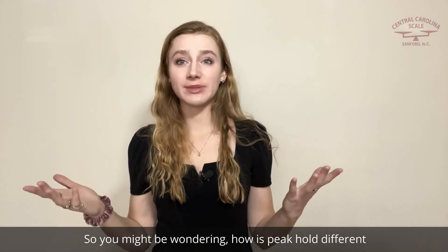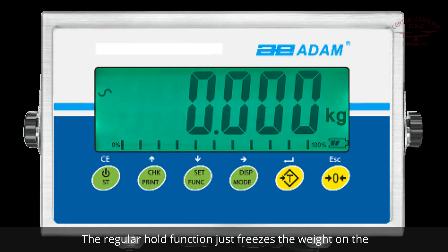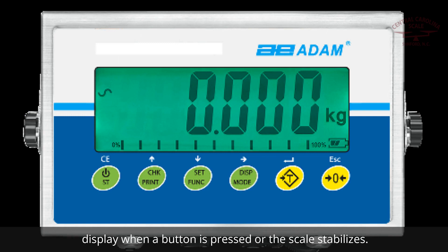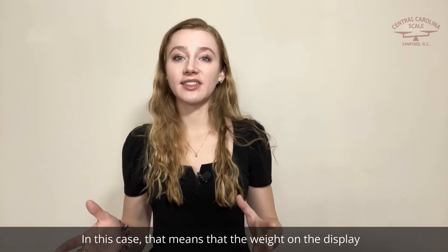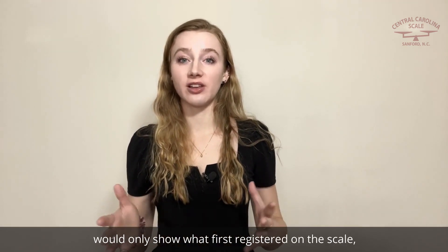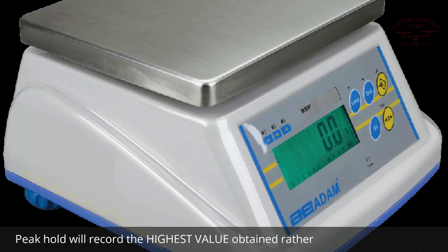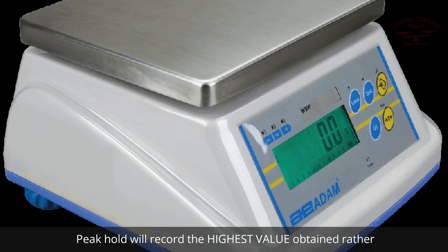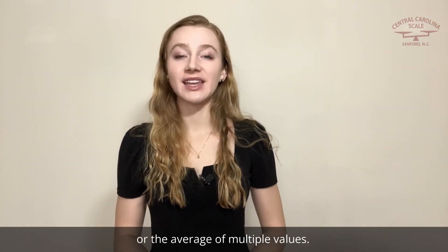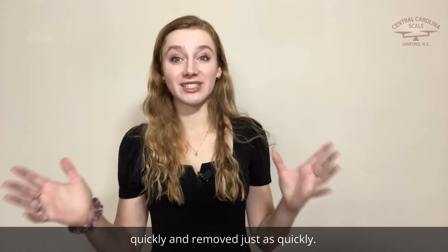So you might be wondering, how is Peak Hold different from a regular hold function? The regular hold function just freezes the weight on the display when a button is pressed, or the scale stabilizes. In this case, that means the weight on the display would only show what first registered on the scale, paying no attention to the weight applied afterwards. Peak Hold will record the highest value obtained, rather than the first stable value or the average of multiple values. It can be useful when a lot of weight is applied very quickly and removed just as quickly.